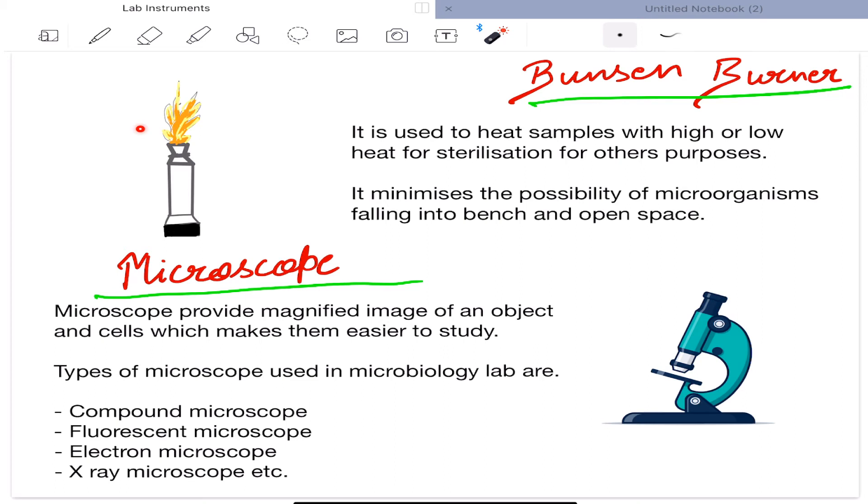Next is Bunsen burner. It is used to heat samples with high or low heat for sterilization and for other purposes. It minimizes the possibility of microorganisms falling onto bench and open space. Now microscope. Microscope provides magnified image of an object and cells which makes them easier to study. Types of microscopes used in microbiology lab are compound microscope, fluorescent microscope, electron microscope, and x-ray microscope.